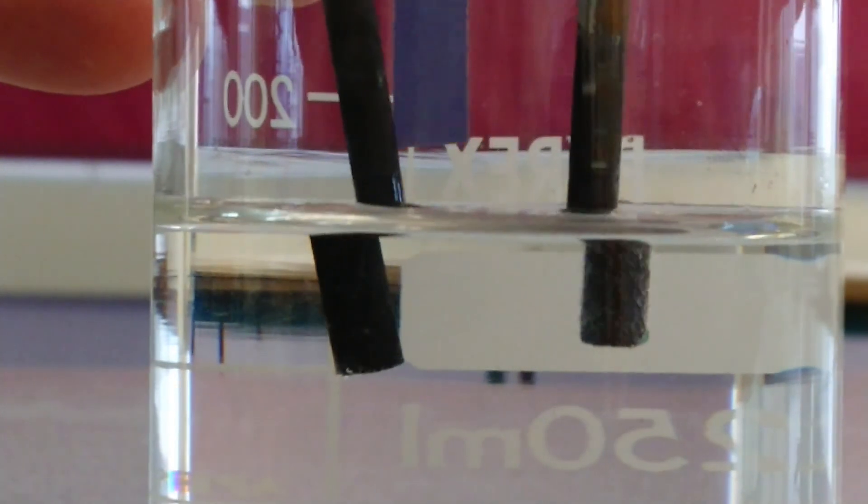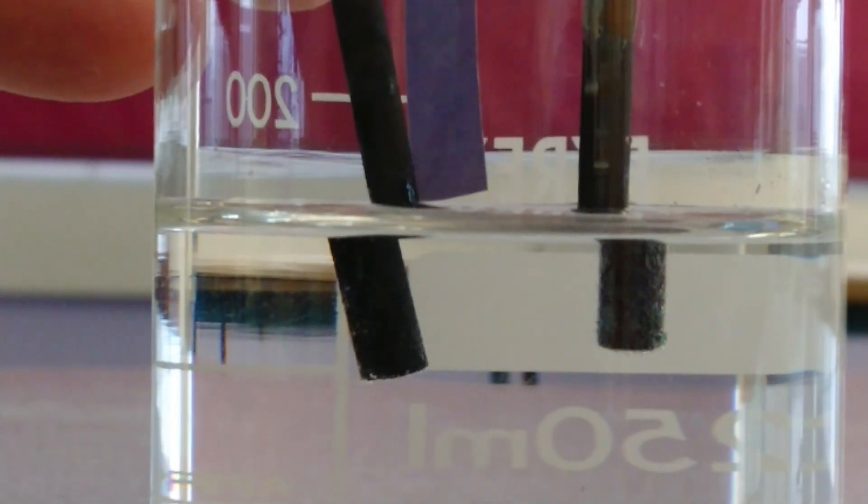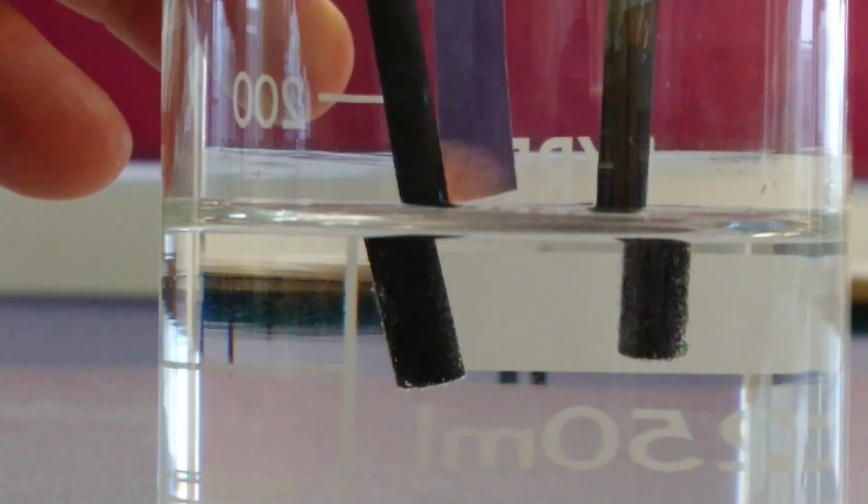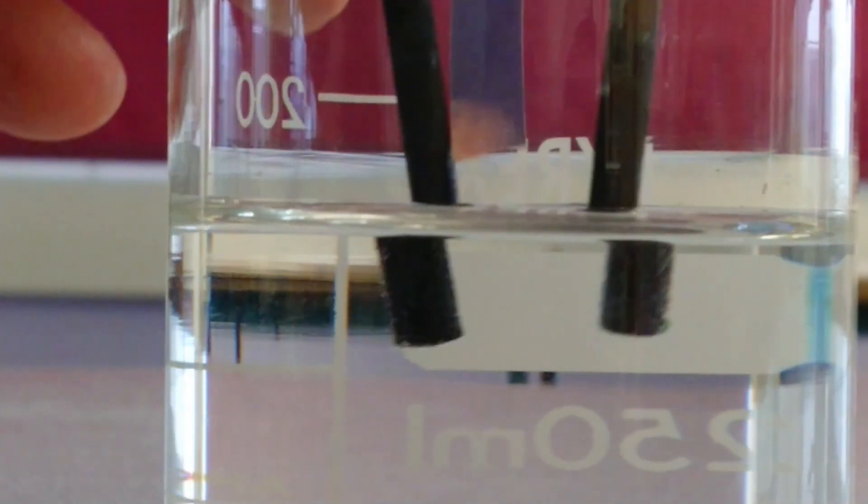So we can see that this is bleaching the litmus paper, so we've got chlorine gas being given off.